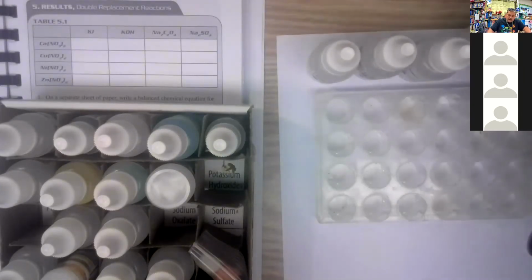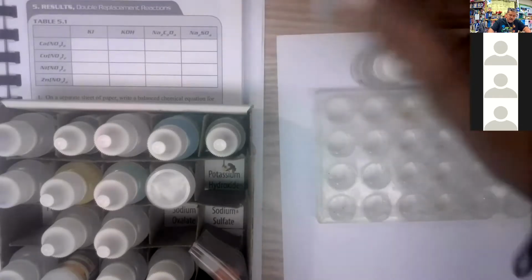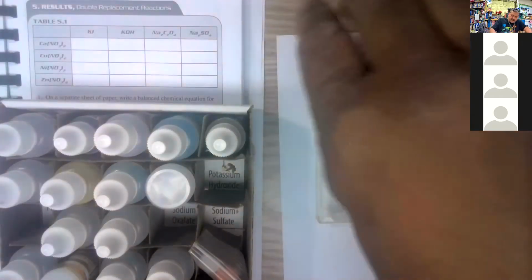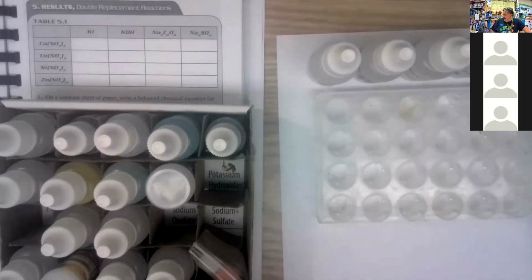Remember, these are dropping bottles, so you don't want to touch the plastic part of the dropping bottle to anything. You're going to let the chemicals drop out of there. All right, that's why it's called a dropping bottle, right? Okay, so let's do the sides now.